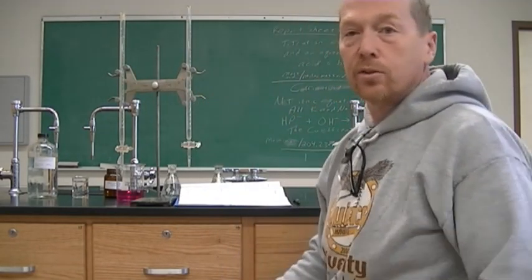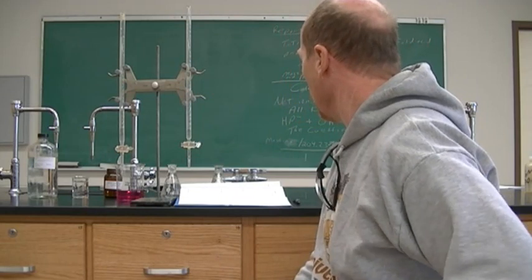All right, that is our final titration for experiment 12. I am going to clean this up and go through the calculations next.